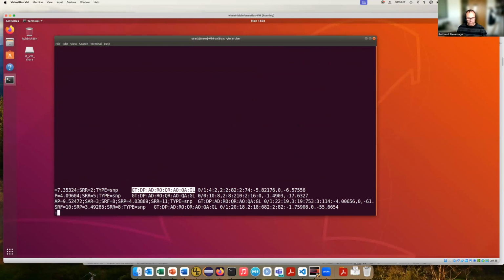And now what happens here is we have some additional data column. So the idea here is that in this format column, you have different fields that are colon separated. And in this next column, or what we see in a bit, all the columns that come after that have the same number of fields as in this format.